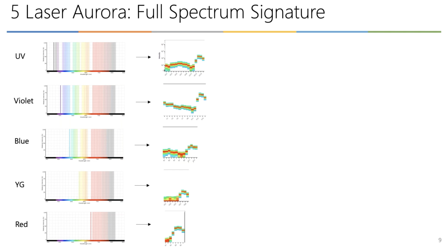Now, lots of people ask us, what are these colors, this red, green, and blue? Think about it as if you were seeing a histogram from the top, and the coloring is like a density plot where the red shows you where we have the majority of the events, and then it goes into a gradient color until blue, where blue is where we have the fewest events for that distribution in that specific channel.